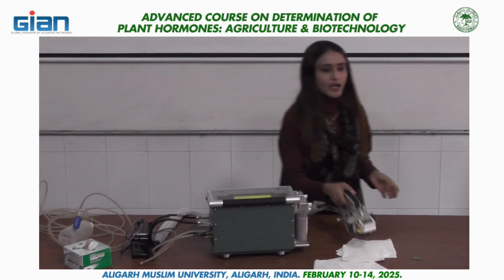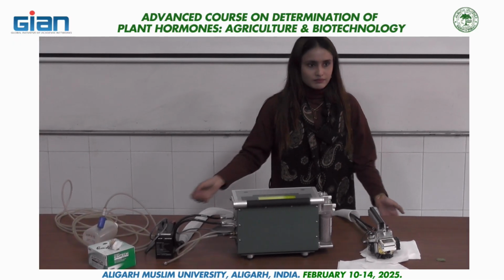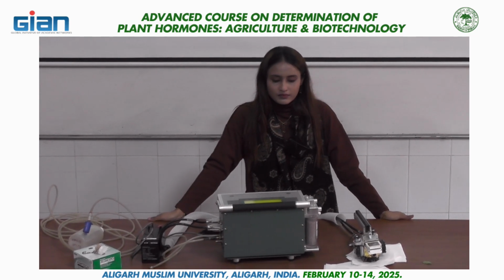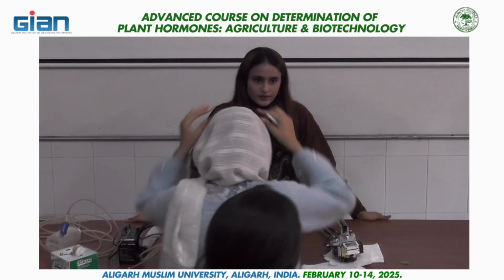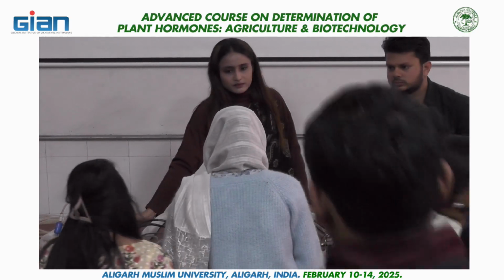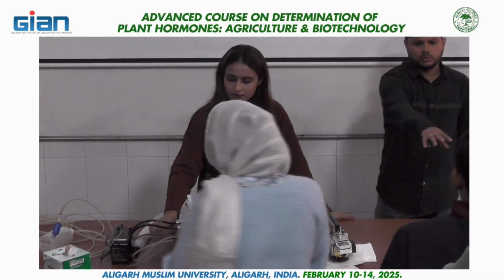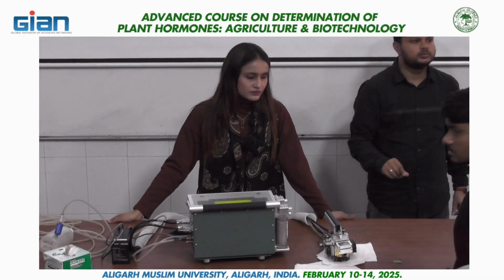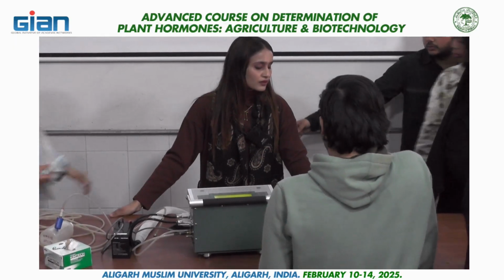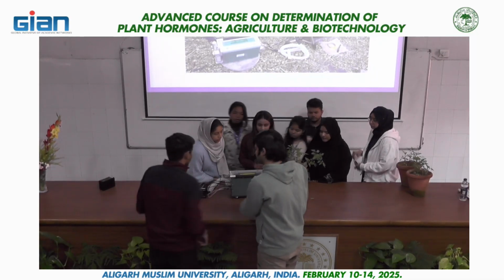So now you may come in a group of 10. Come this way. Plant to liya. Tough area.